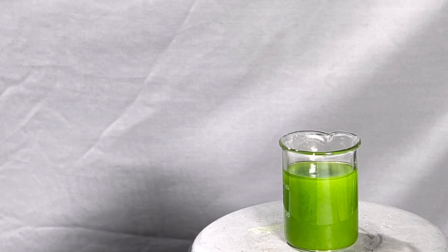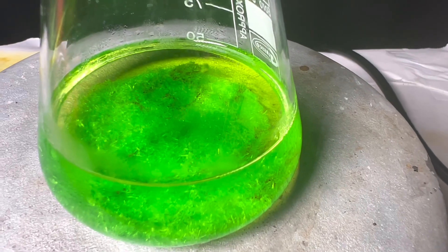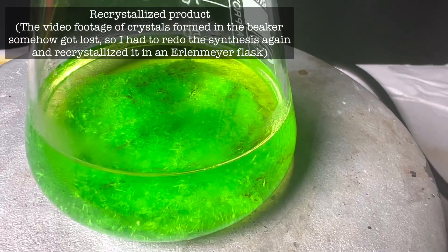After that the beaker was placed in the refrigerator overnight. The next day we got these beautiful crystals of copper DMSO complex, which was vacuum filtered and dried.